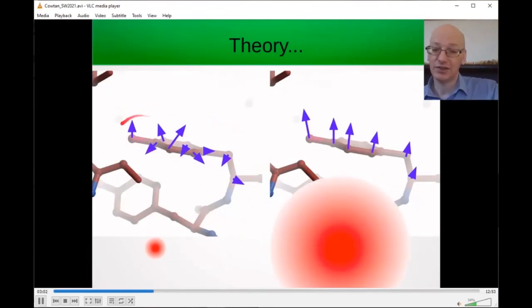So that looks like the case on the left over here. Whilst there is a broad trend that the atoms need to be moved upwards, there's enough noise that individual atoms may be moving in any direction. And as a result, this tends to rip the model to shreds. And to avoid this, we need to introduce stereochemical restraints. So we have the experimental observations pulling the model to bits, and the restraints trying to hold it together in order to extract these general shifts, these large-scale motions to bring the structure into the right place.